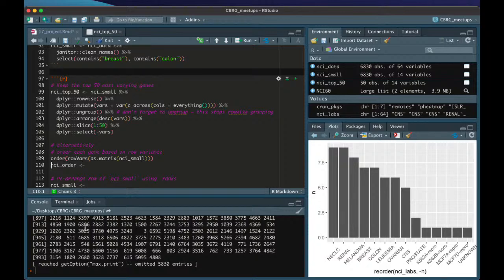How do I explain this? Let's take a simpler example. Apologies for this. Let's say we had a really simple vector, A, with 400, 300, 100, and 200. Now let's say we wanted to order this from lowest to highest. So 100, 200, 300, 400. How would we do that? Well, one way, let's build up to that. How would we select the smallest element of A? Well, we know that the smallest element is 100, so that is 1, 2, 3, the third object.